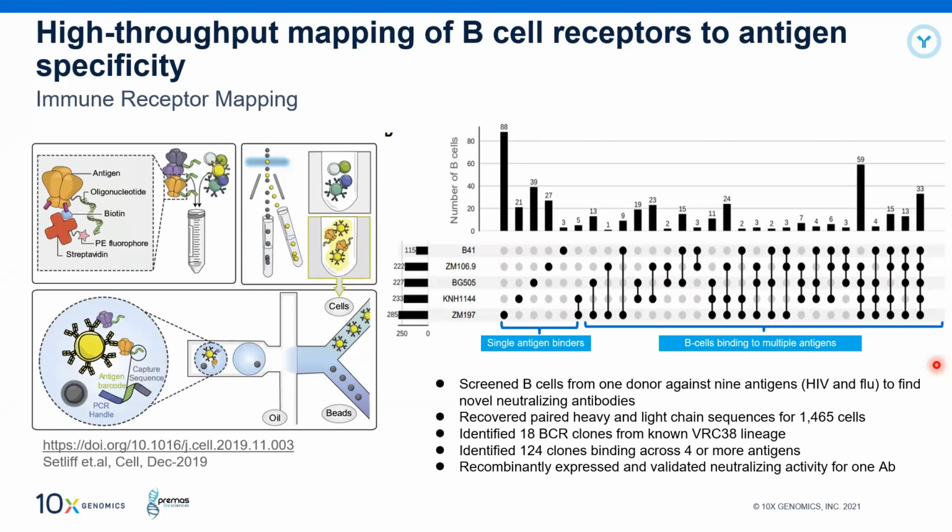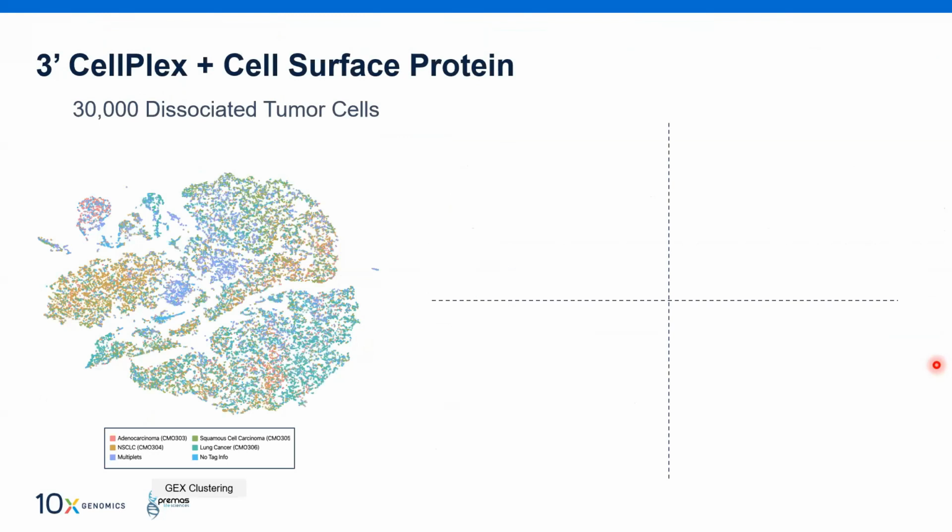People are working on such vaccine development programs, which can generate such broadly neutralizing antibodies in the human body that can manage many pathogens. We have specificity also, but we need the broadness also. So this is the kind of research people are doing, which is broadening the immunological aspects of vaccines, I can say. Now, as I told you, we are able to multiplex the cells and then generate the data using the CellPlex assay.